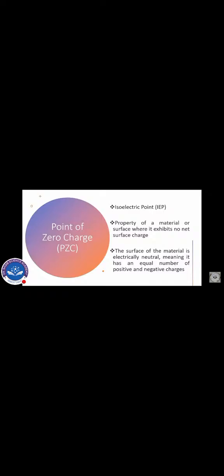Bismillahirrahmanirrahim. Hello and welcome to Dr. Saqib Khan Science Academy. Today we will learn about point of zero charge, how to measure the point of zero charge experimentally, and then how to plot the point of zero charge and measure it from the experimental data. Point of zero charge is also known as the isoelectric point.